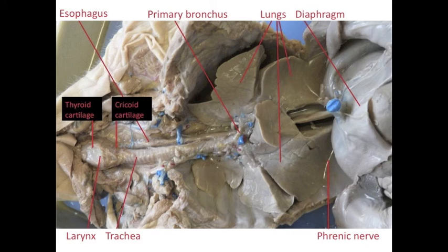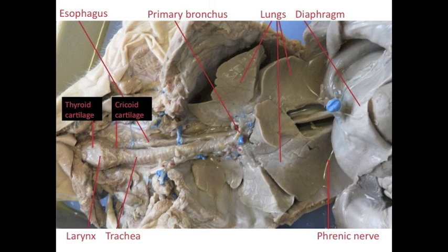The largest structure of the larynx is the thyroid cartilage; it looks a little bit like a shield. Just inferior to the thyroid cartilage is a ring of cartilage called the cricoid cartilage. Another structure you should be familiar with is the thyroid gland. It has been removed here, but it might look like some tissue that's been pushed off to the side of the larynx.